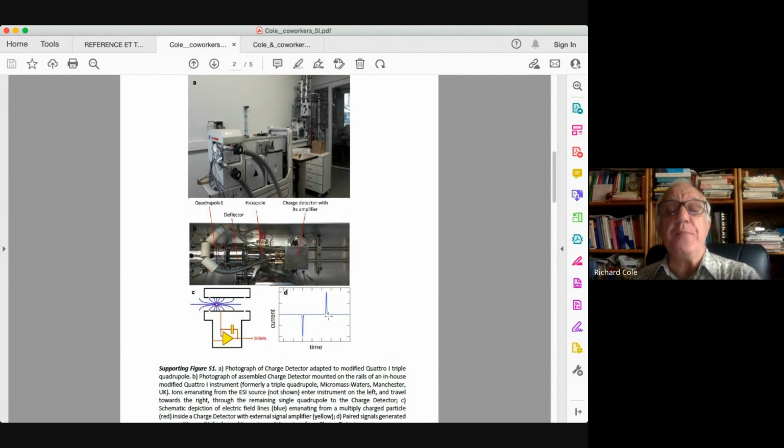The second thing we're measuring is actually the residence time inside the tube. And that is really the time between our initial spike here and our exit spike. So that time, residence in the tube, and I'll show it as time of flight on later slides, is going to give us information about our mass to charge value.